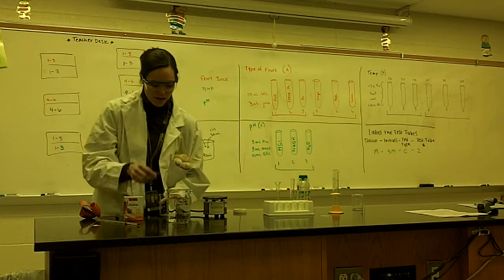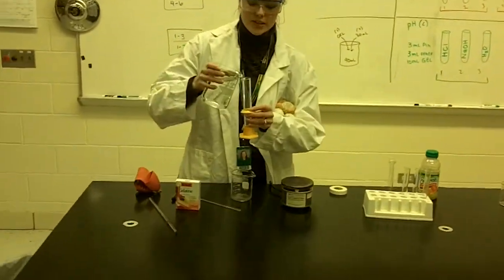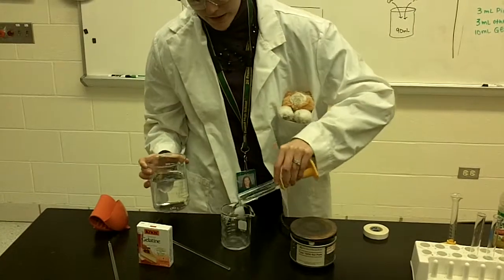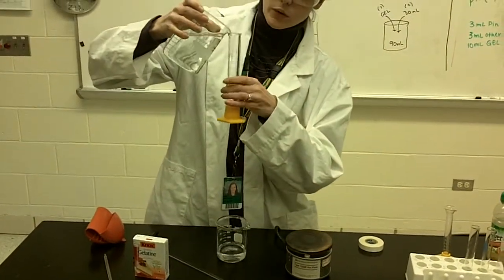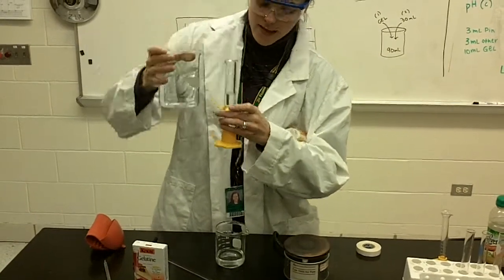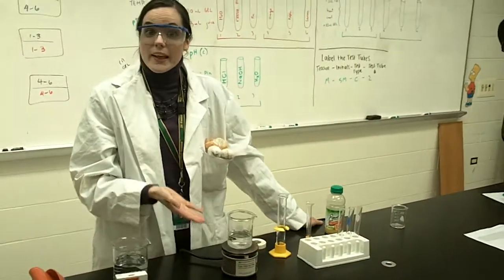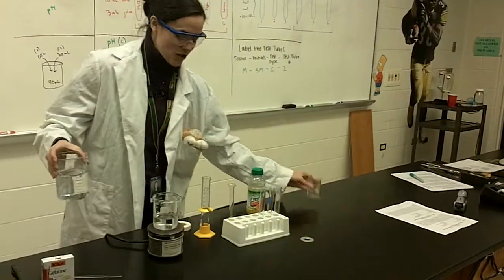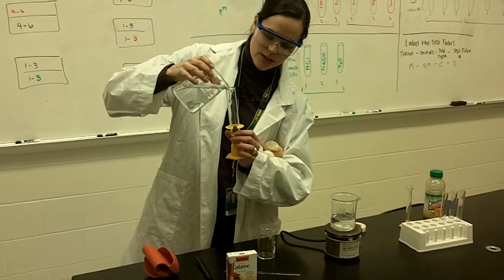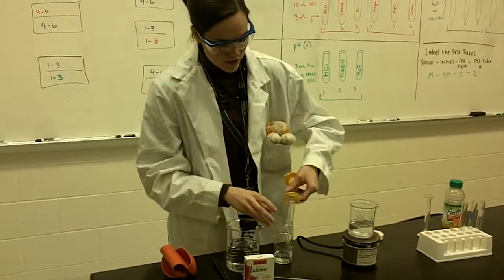To make the gelatin you need two sets of water. You need 90 milliliters of water that is going to be hot, so you'll use your larger graduated cylinder — measure 50 milliliters, pour that in, then go up to 40 to give a total of 90. This needs to go on your hot plate. In the meantime, measure out 30 milliliters of cold water using your large graduated cylinder.